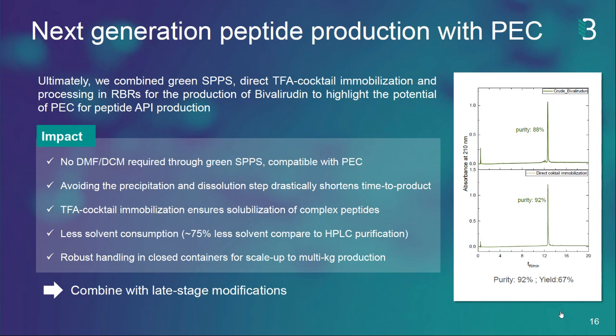And obviously now the last question. Did you try to use another chemoselective reaction than oxime to immobilize the peptide for PEC? We have tried, but oxyamine is quite robust and quite stable. So we settled on oxyamine. We have tried different chemistries as well. Okay, so this turned out really to be the most versatile and superior to other methods.